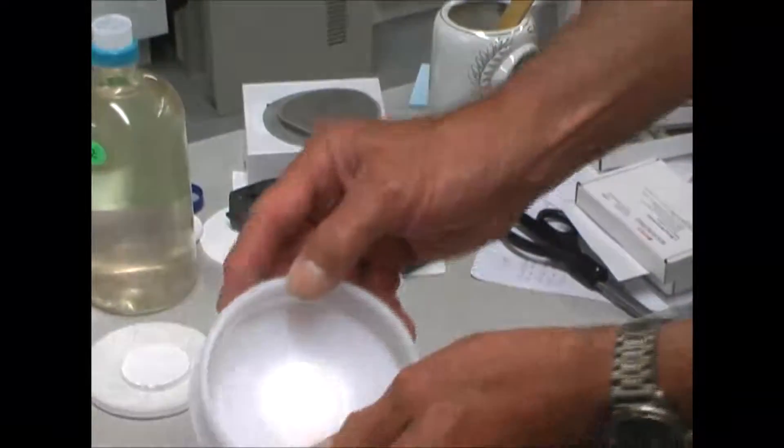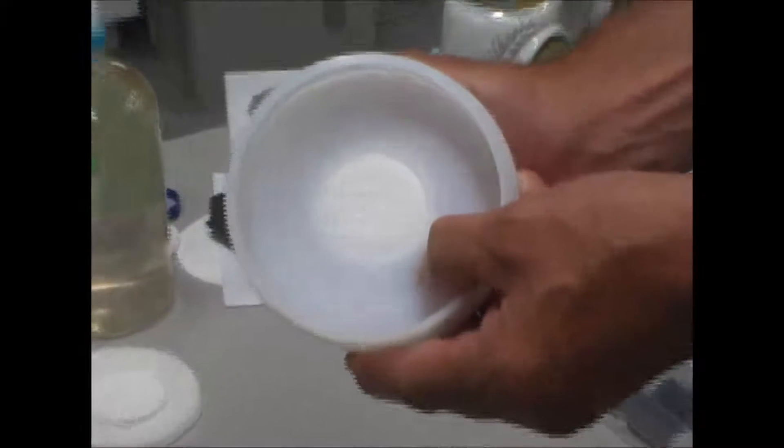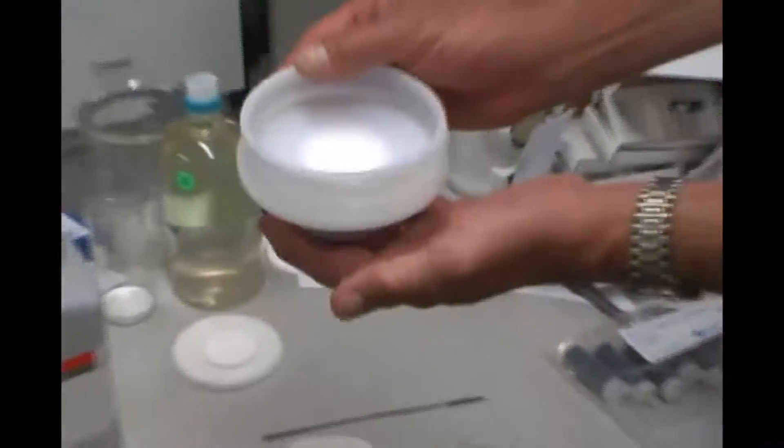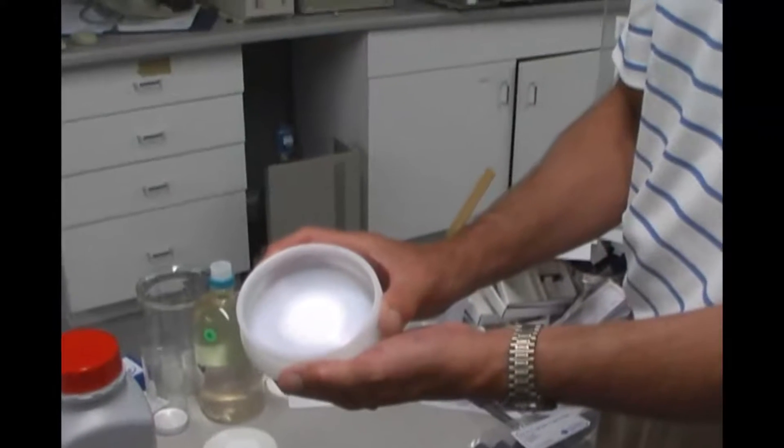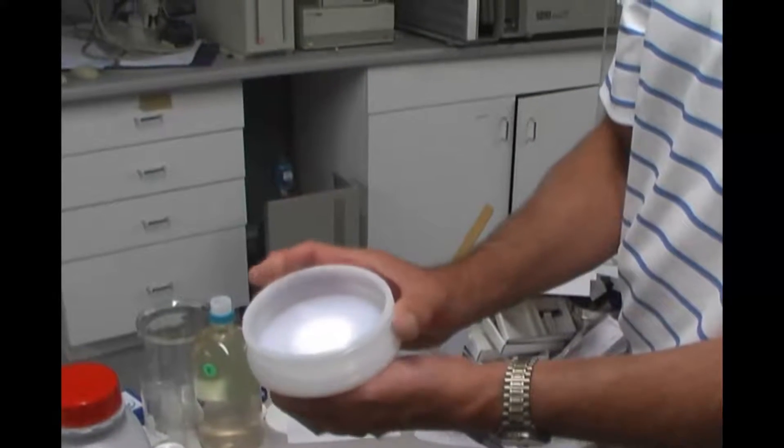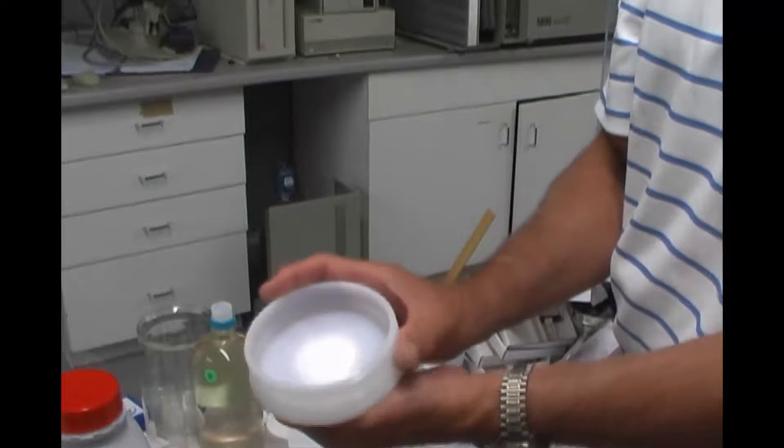But the important part is that the SPE disc, in this case the C18 disc, is nice and clean. So it shows that with this style holder of protecting the analytical disc with two pre-filters on the top, we can handle very dirty samples that have high particulate content.